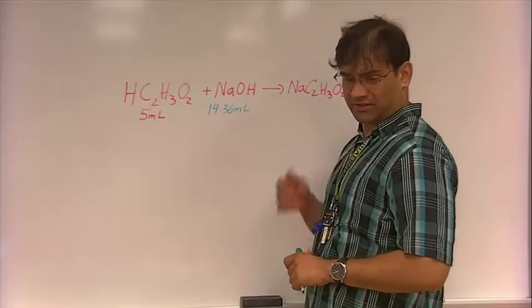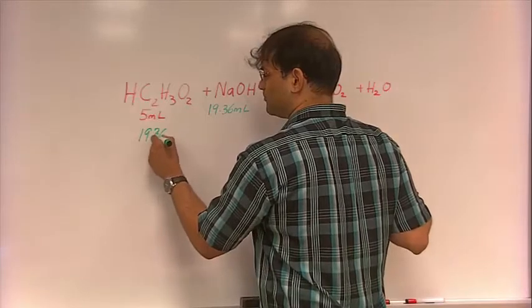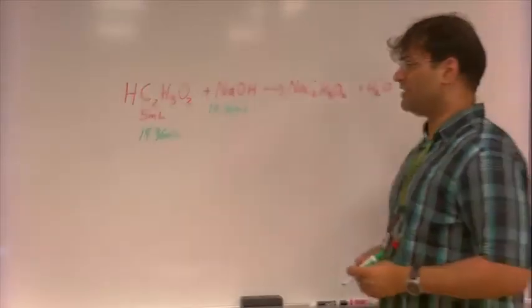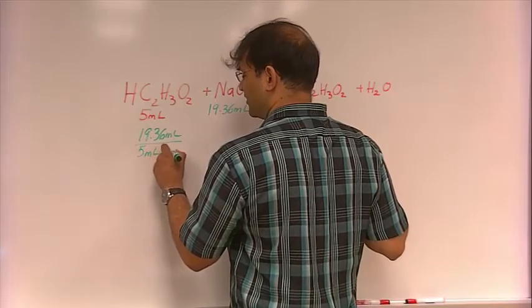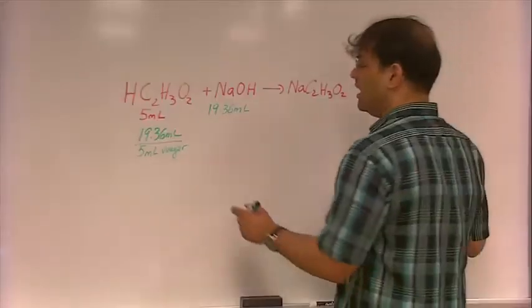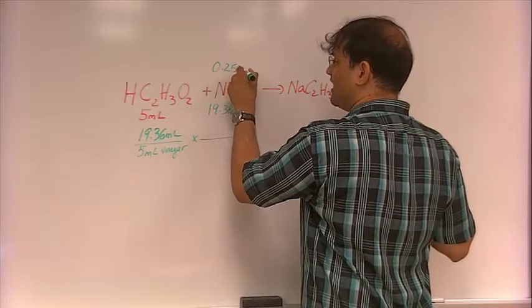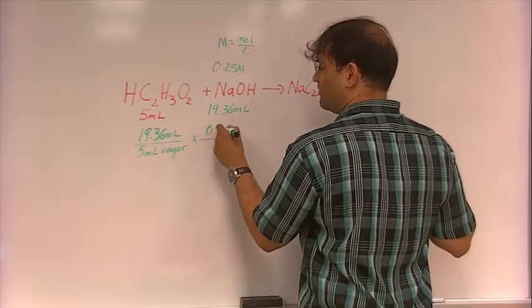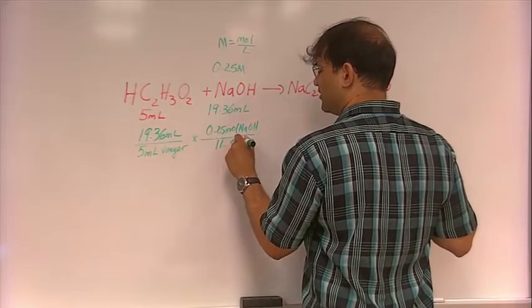So here's how we'll do this calculation. This 19.36 mils of NaOH neutralized 5 mils of vinegar. Remember, you added 5 mils of vinegar and put it in 50 mils of DI water. This had a molarity of 0.25 molar. Molarity is moles per liter. So 0.25 moles of NaOH in 1 liter of solution.